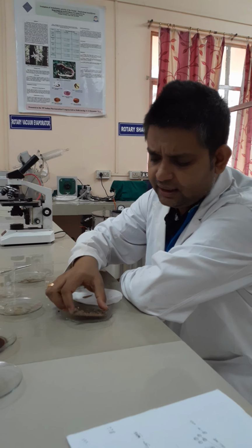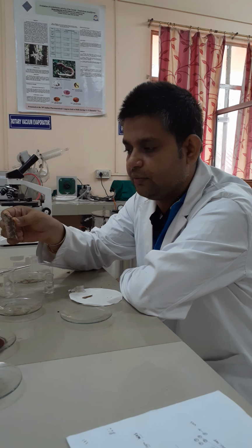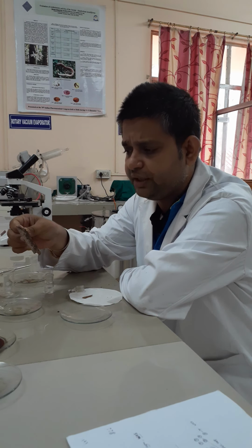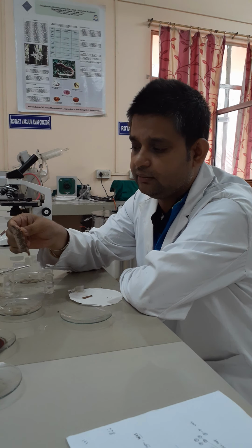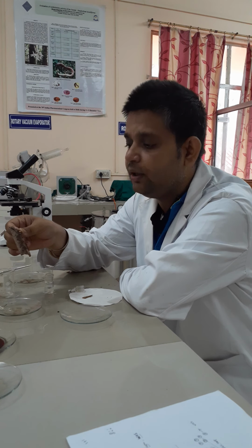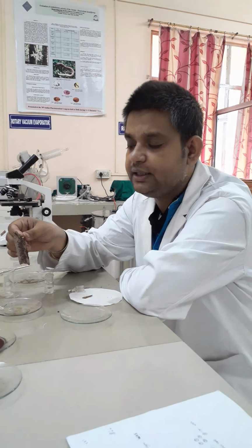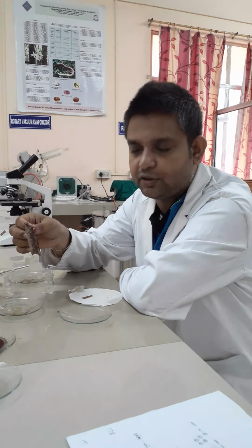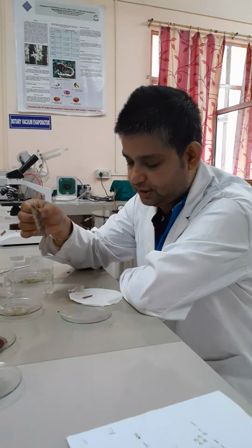As you can see, this is the piece of Cinchona bark. It is very hard and very tough to break. So this is the bark of Cinchona. Now, as it is very hard in nature, we have to boil it for at least 1 hour to 2 hours so that the cells get softened, and it is very easy for us to take the transverse section.